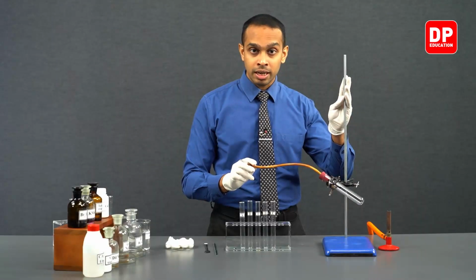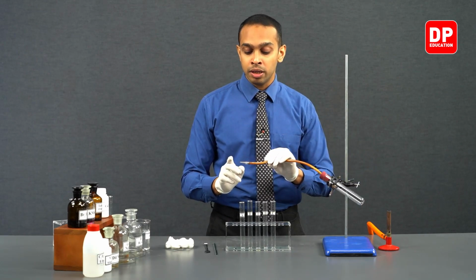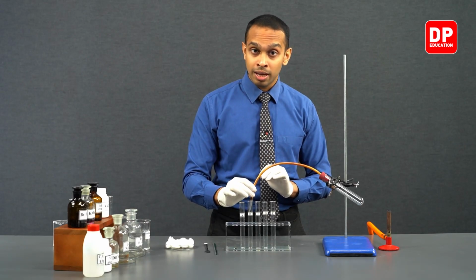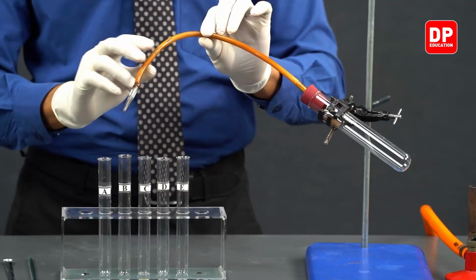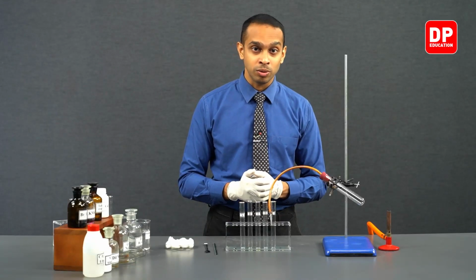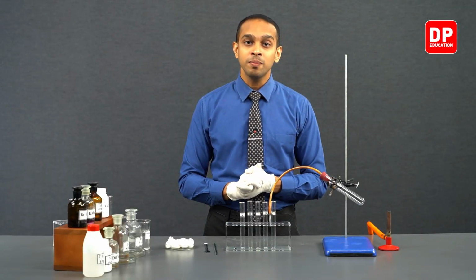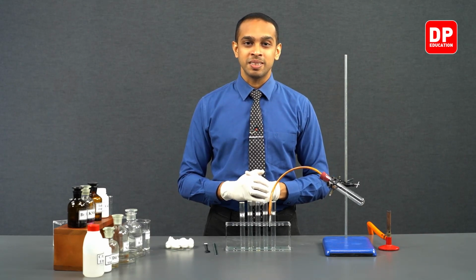We will be using this setup to produce a gas, and the gas is going to be delivered with the help of a delivery tube into each of these test tubes, so that the chemicals contained in each test tube can react with the gas that is produced. We will be using a Bunsen burner as well. So these are the chemicals and the equipment we will be using for this experiment.